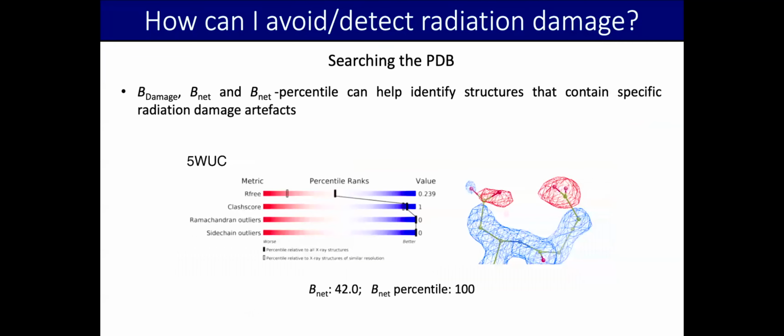And then lastly, as I mentioned before, you can also run our software RABDAM to calculate BDamage and BNet percentile metrics for structures that have been deposited in the PDB.